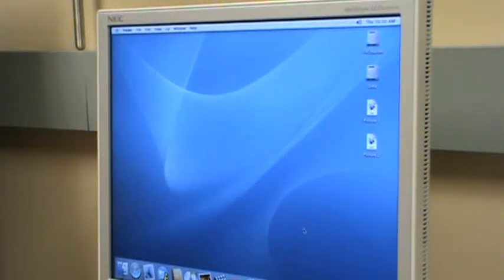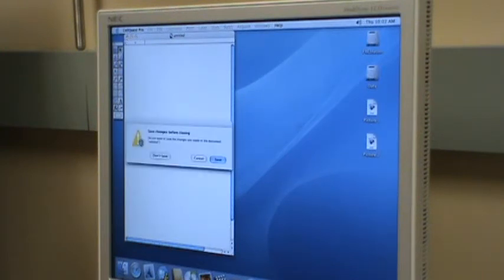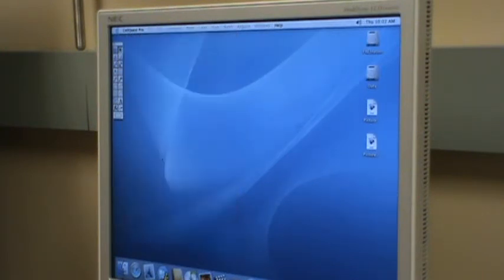So at the bottom of the screen, there's a CellQuest. That's the software we want to use. Once you open CellQuest, it gives you an empty document. We don't want to use that. We already have a template.